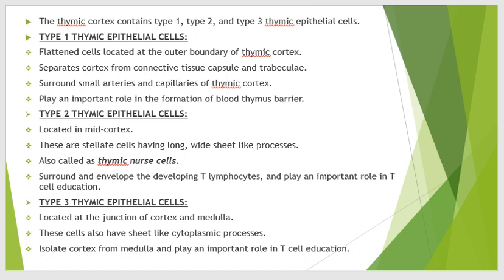Then the type 3 thymic epithelial cells are located at the junction of cortex and medulla. These cells also have sheet-like cytoplasmic processes and they isolate the cortex from the medulla and play an important role in T cell education.